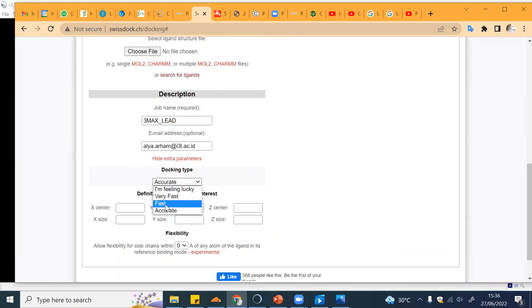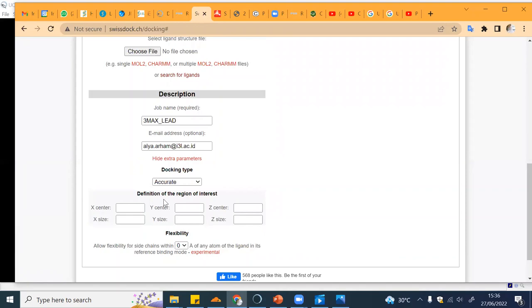If you want to limit the docking region, for example you already know the binding site, you can put the location or the coordinate of the area that you want your ligand to be docked.